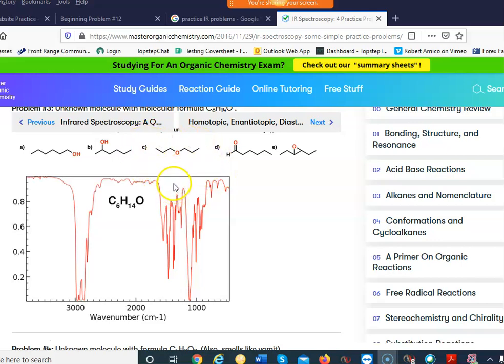Okay, so that makes sense. Everyone who put D, I can see why you did it, because it looks possible, but again, the fangs have to be the same size. These two little peaks are too small. If you've got this junk up here and the peaks are about the same size, that's junk. In order to have fangs here, you have to see two very obvious peaks. If you kind of have to squint your eyes and say, well, is that maybe the fangs? Then it's probably not the fangs. Okay? So I'll make sure that you guys understand about the aldehyde.